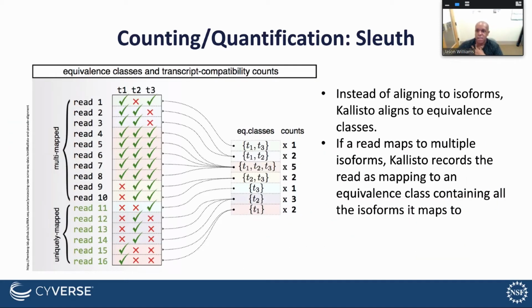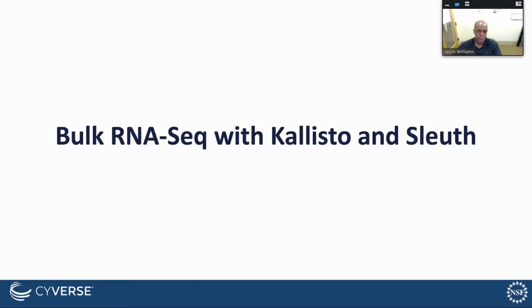And again, in some ways, maybe this should have been an earlier slide. It's a matter of looking through any given set of transcripts, seeing what reads match, and coming up with what they call equivalence classes. Go read the paper if you want to get more into that, or I could take questions as they come, but that's sort of the technical meat behind that paper.